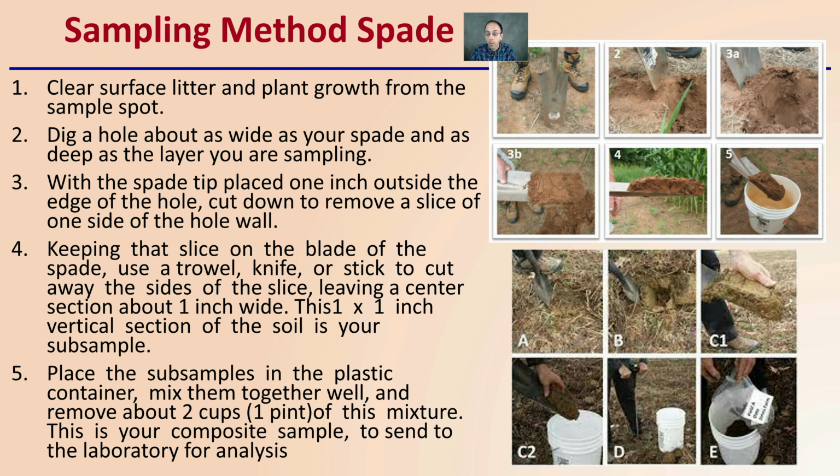Now, what makes the soil core so nice is it's stainless steel. It's all inclusive. If you don't have that, you can take a simple 1.5 inch piece of PVC pipe, put that in the ground, and mark it with that 6 to 9 inches. Your goal is to get to at least 6 inches. If that goes well, go up to 9 inches. You don't want to go much more than that because that's really your root zone profile. You would pound this into the ground, and take that core and put it into your bag right here.